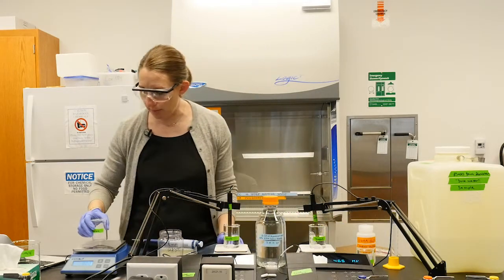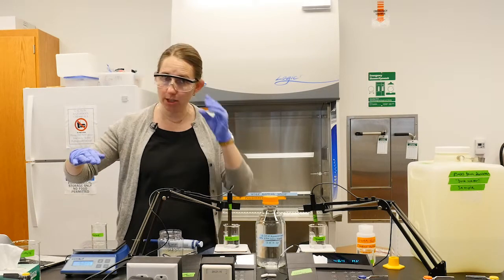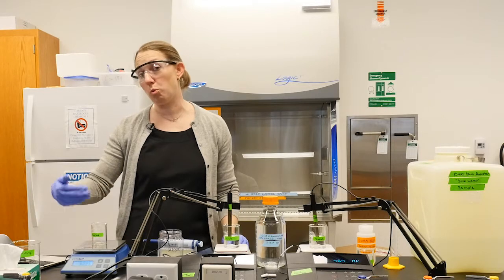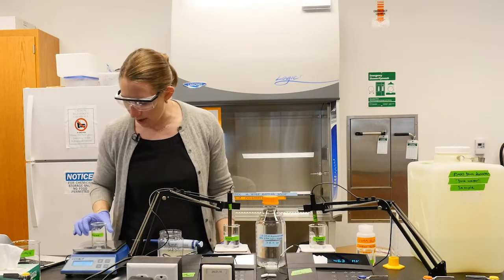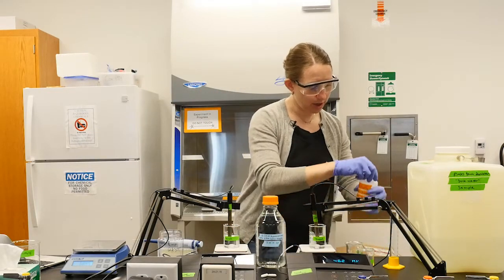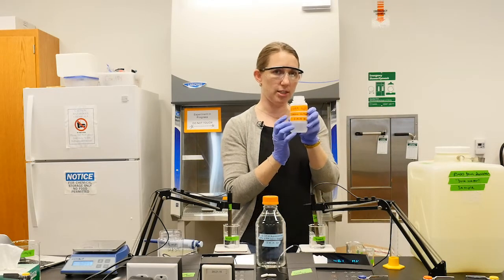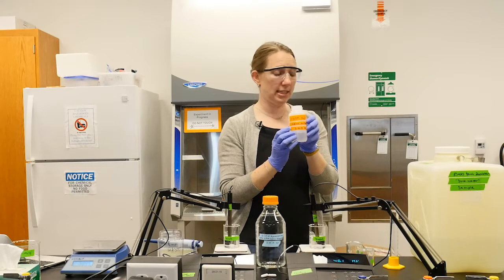So we're going to start by putting our beaker on a balance here. We're going to tare the balance, so we'll just set it to 0, and then we'll add our water and record the weight of the volume that we add. So we're going to tare this. It's reading 0. Okay, we'll take our beaker over here, and we're going to pour in 50 milliliters of our standard. So again, this is our 0.003 molar sodium carbonate.